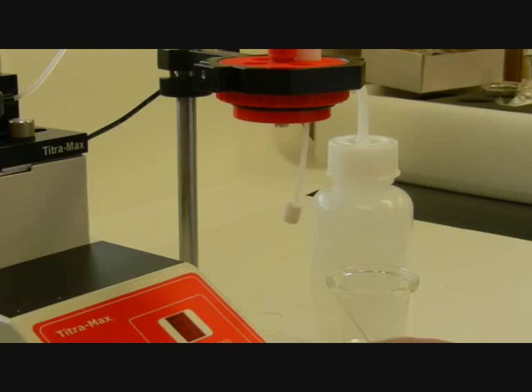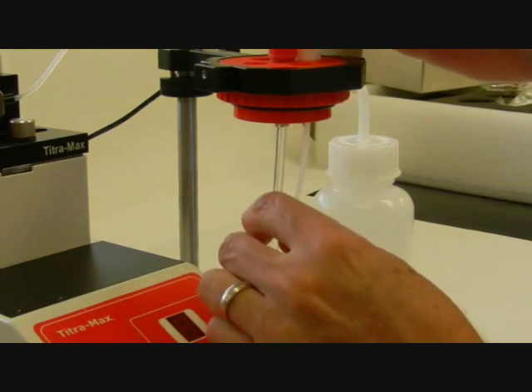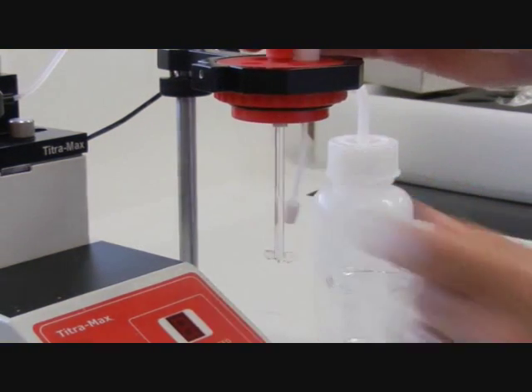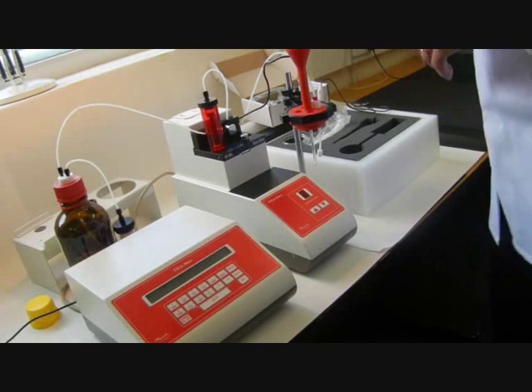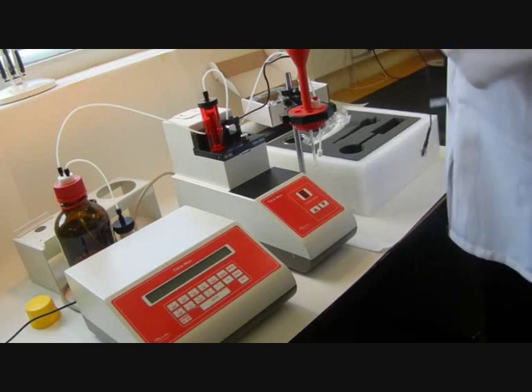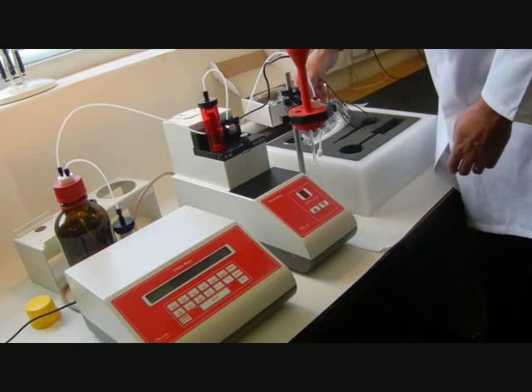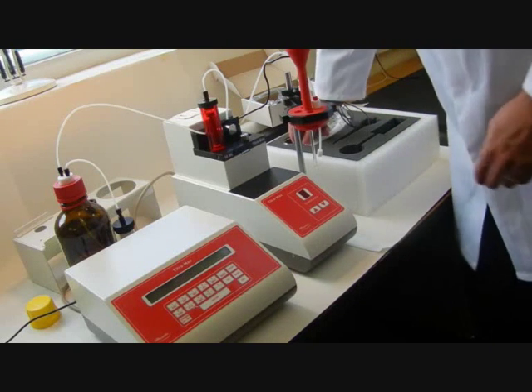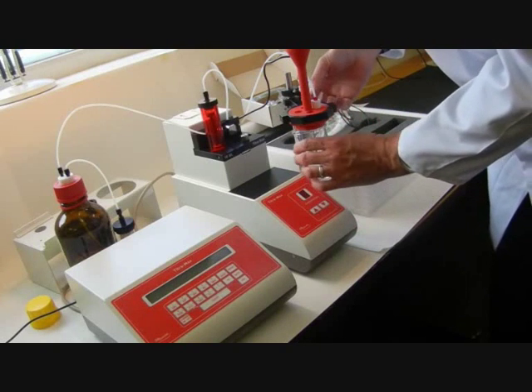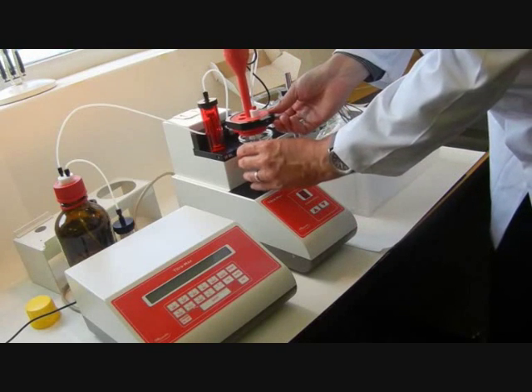Next we can fit the stirrer bar simply by pushing up into the stirrer motor. The electrode there we do not need to connect just yet. Get the titration vessel in place.